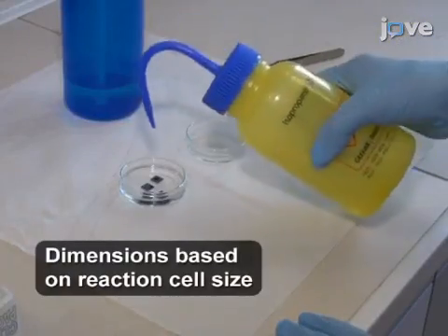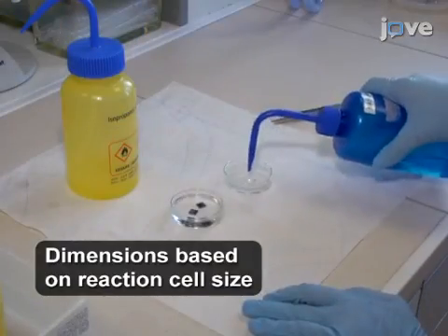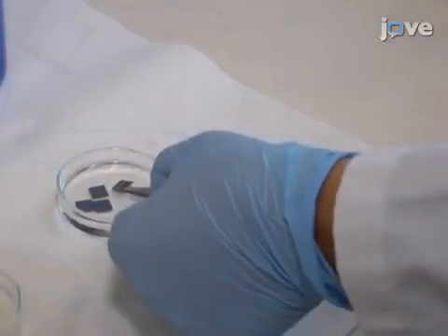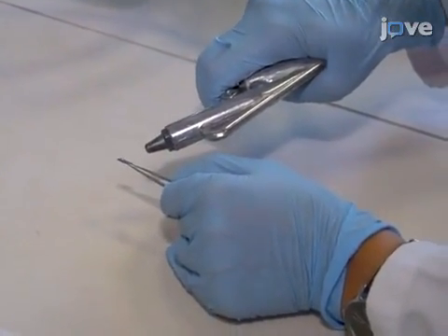To begin this procedure, clean a 10 by 10 mm silicon substrate in isopropanol and rinse with deionized water. Blow dry the substrate with nitrogen to ensure good adherence of the film and uniform covering of the substrate.